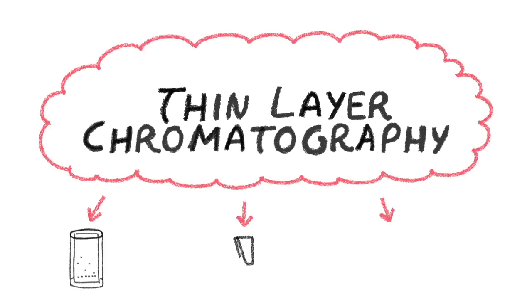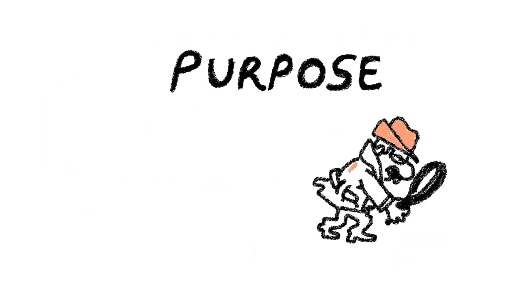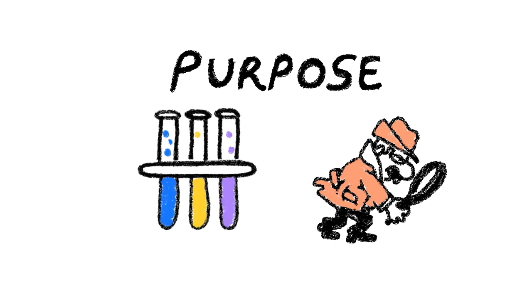Welcome everyone to this introductory video on thin layer chromatography, also known as TLC. Throughout this video, you'll learn what TLC is, its importance, and how it is conducted. The purpose of TLC is to separate mixtures and also identify unknown ingredients in drug compounds.